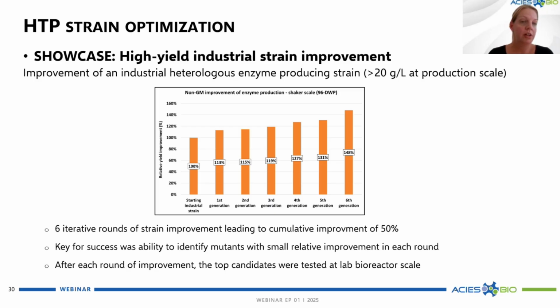So traditionally, these subcultivations were done in shake flasks or Falcon tubes, and you subcultivated the strains by hand, which can be labor intensive because it is ideal to subcultivate the strains in the exponential phase all the time. You don't want the strains to go into the stationary phase, because then you select for unwanted mutations like adaptation to stationary phase or dormancy or something like that.